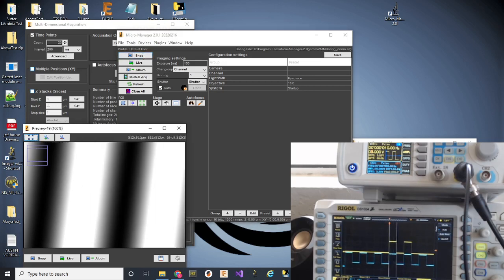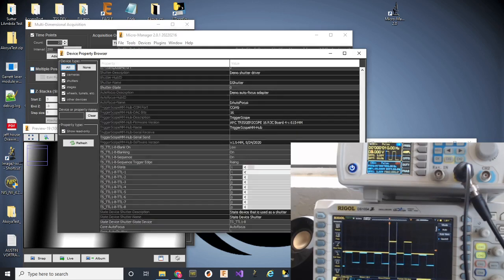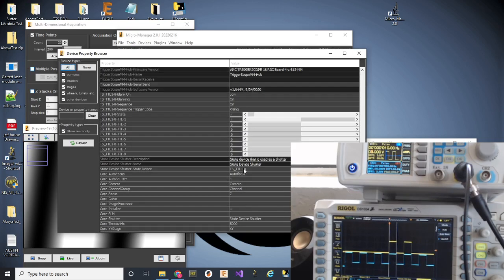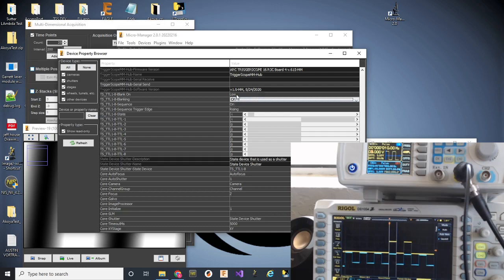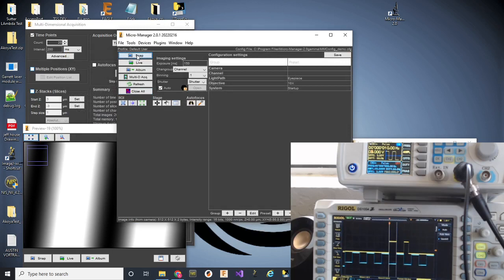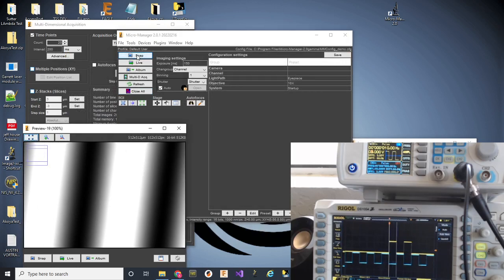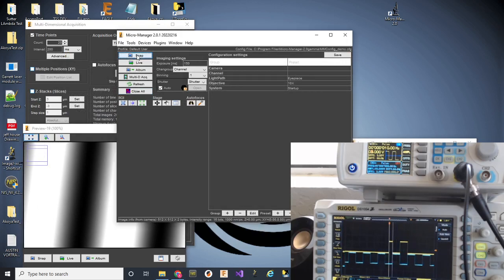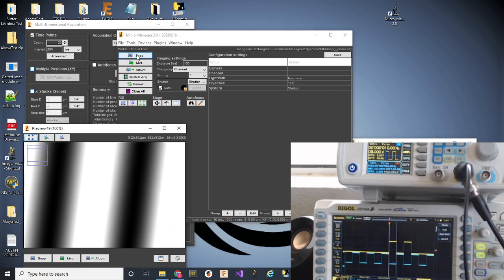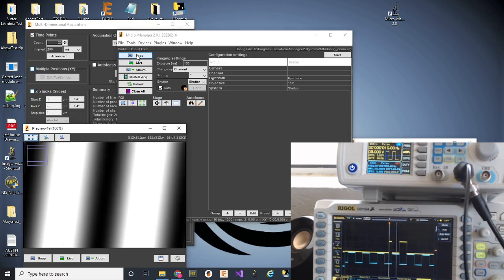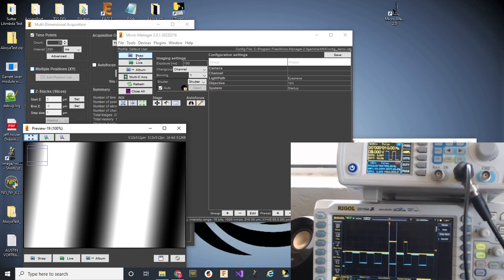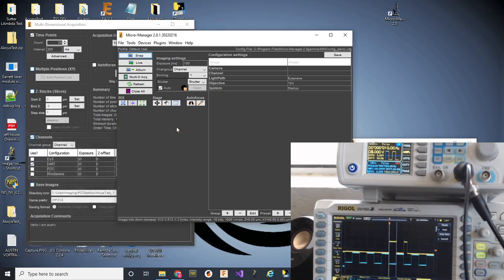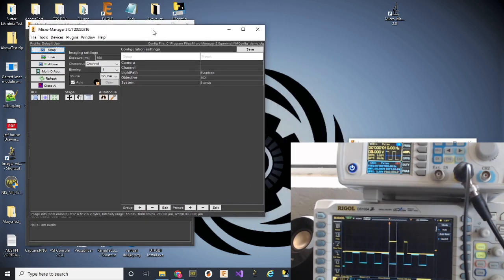Just to show, we can invert this. We'll go to the device property browser, scroll down, and we'll set this up for blanking on high. So, now, we go high when the input goes low. So, it's blanked on high and when the input goes low, the output is enabled. This would be a logical AND slash NOT. So, that's the effective output of blanking. That's what it does.